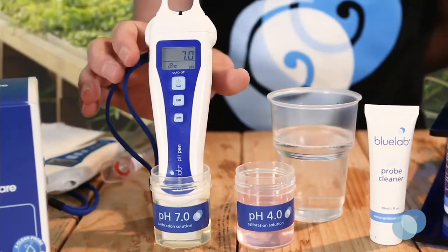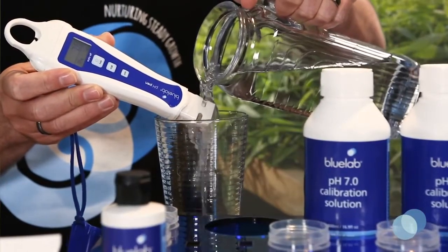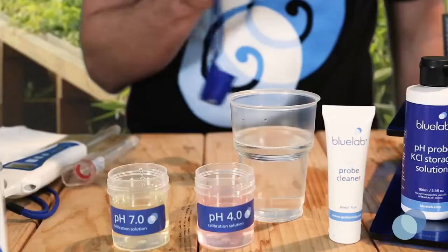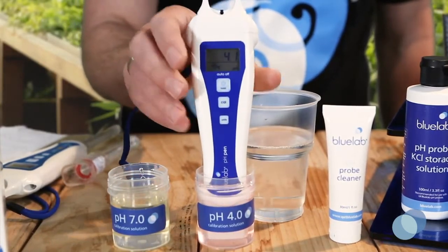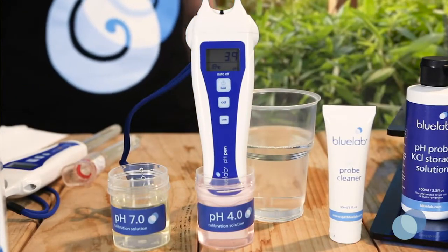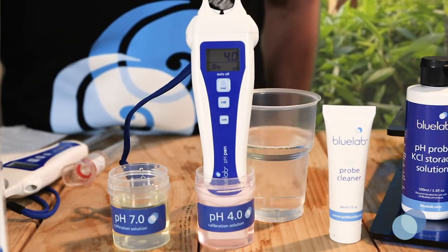Rinse the probe tip in clean tap water and then gently shake off any excess water. Next, place the probe tip in fresh Bluelab pH 4 or pH 10 calibration solution. Give the probe a gentle swirl to ensure you've got good contact between the probe glass and the calibration solution. Then wait for the reading to stabilize.